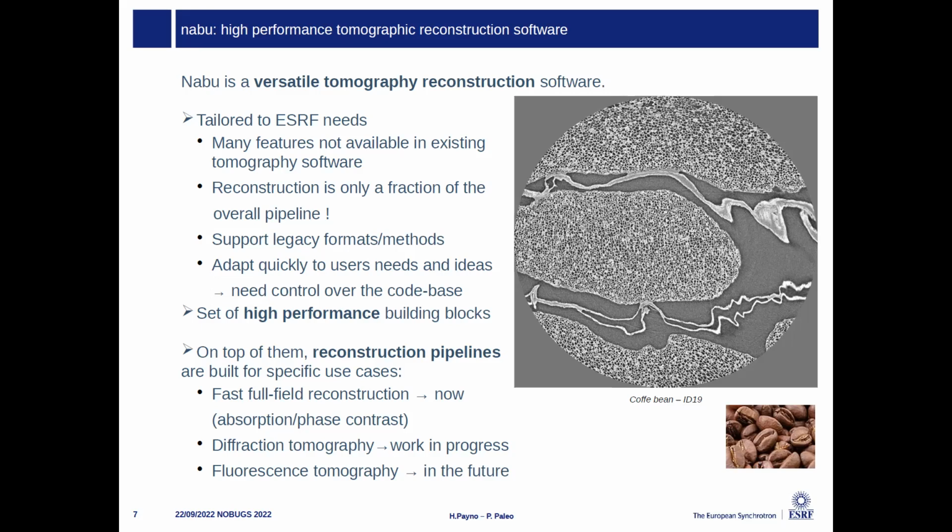Then it's a set of high performance building blocks, as I said. And with those building blocks, we are creating pipelines in order to treat specific use cases. So the first one was the fast full field reconstruction, which is in production now at several beamlines at the European Synchrotron.